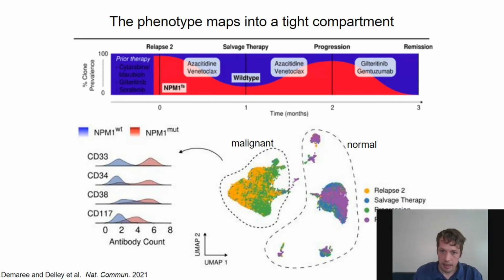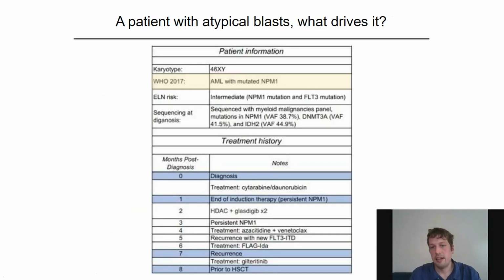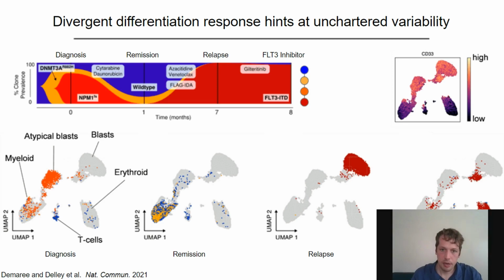Next, I looked at a second patient, in this case, where the flow study that clinicians typically do in the course of the diagnosis uncovered the atypical blast compartment, meaning that the immunophenotype was somewhat uncommon. And so I subjected these same samples to the DAb-seq experimental workflow. And again, you have a fish plot at the top from what we saw on the genotypic side.